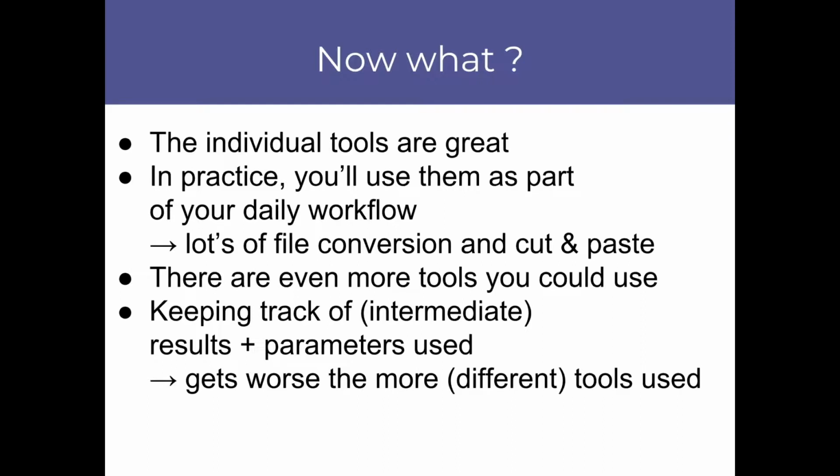The other thing, if you use some of these graphical interfaces, is keeping track of the intermediate results and the parameters that you have used, because you will need to report that afterwards in the manuscript when you try to publish the experiment. And these issues become worse the more different tools you're using to really get a concise, reproducible summary of what you have done.